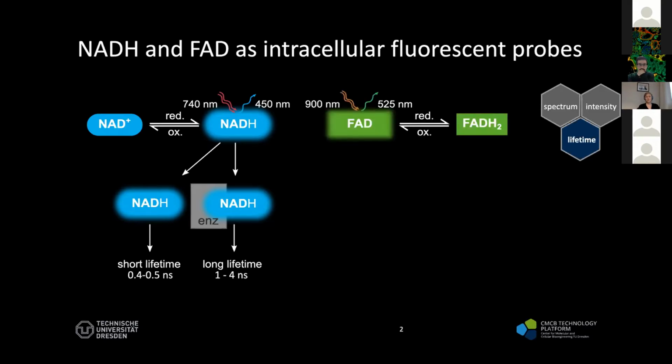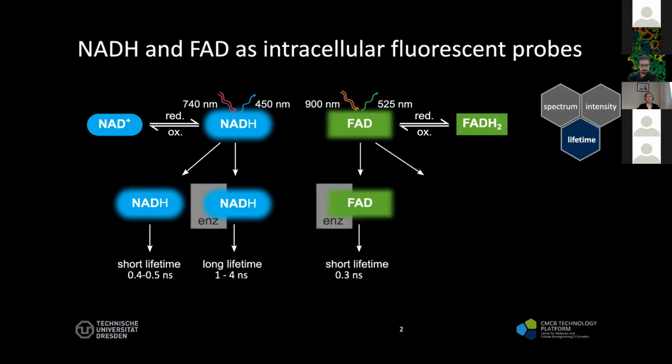Now coming to FAD, on the contrary, it is fluorescent in its oxidized state. In two-photon microscopy, it can be excited in the range of 880 to 900 nanometers, and it emits in the lower 500 nanometer range. Its lifetime is also dependent on protein interaction. In this case, it is the short lifetime fraction which represents the protein or enzyme-bound FAD subfraction.